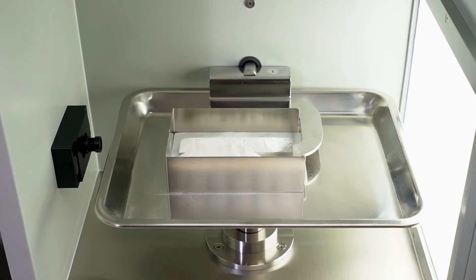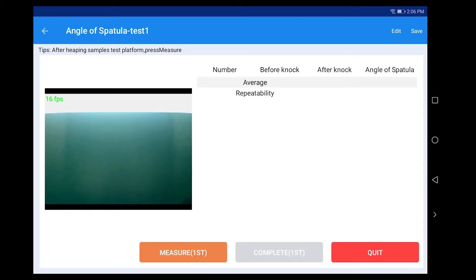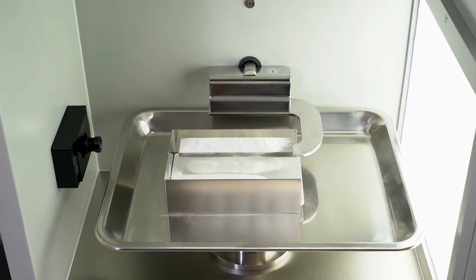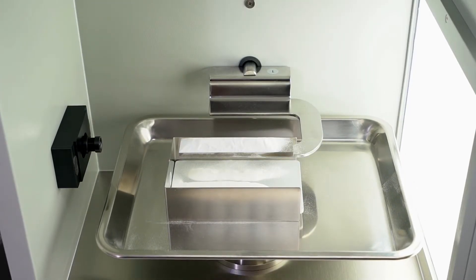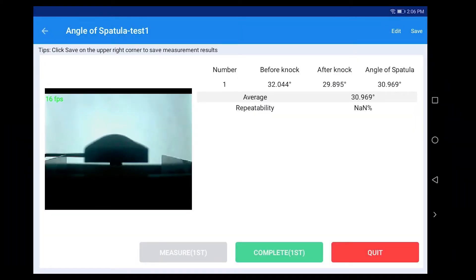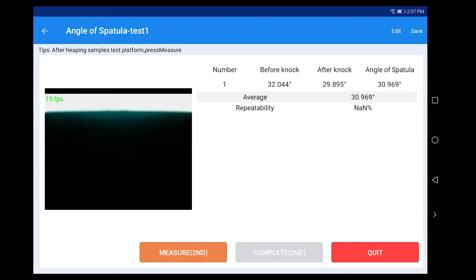Gently scatter the testing sample on the plate in the stock pan. Click 'Measure'. The system will automatically measure the angle before and after the shock impact, and automatically calculate the angle of the spatula.